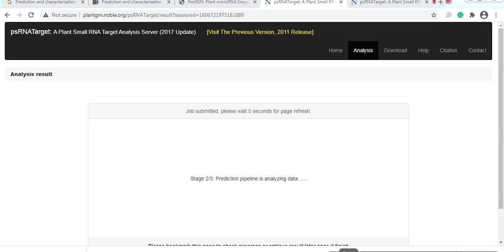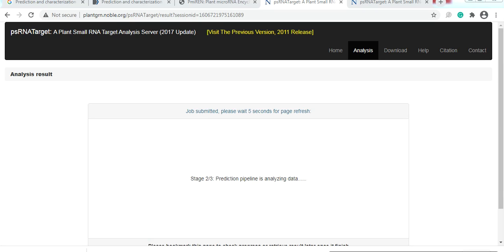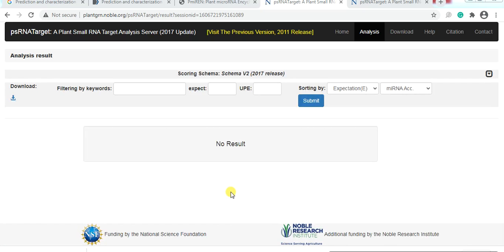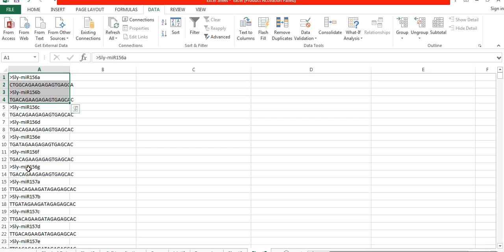In this way you can predict targeted microRNAs. If you are working with any microRNA and want to know which gene it targets, you can find it this way. If no result appears, it means those two microRNAs did not target your specific genes. In that case, try other microRNAs.